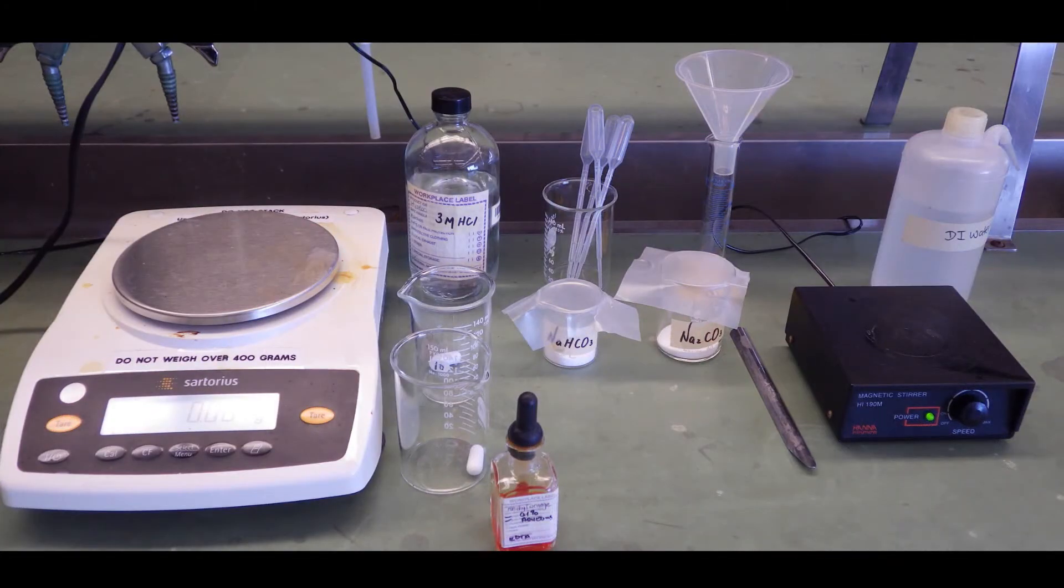Here's the equipment that we'll need for this experiment. Obviously we'll need a top loading balance. In the beakers we have these white powders. That's pure sodium bicarbonate and pure sodium carbonate. We'll weigh these into our 150 ml beakers. We'll need a stir bar, a mag stirrer on the right. Here's our methyl orange indicator up front. We have this approximately 3 molar HCl in a bottle. We have a 25 ml graduated cylinder in the back and a wash bottle. And that's about all we need.